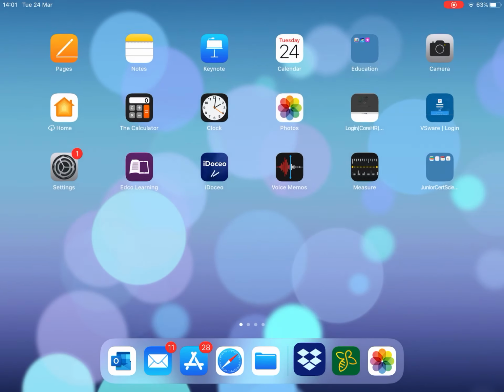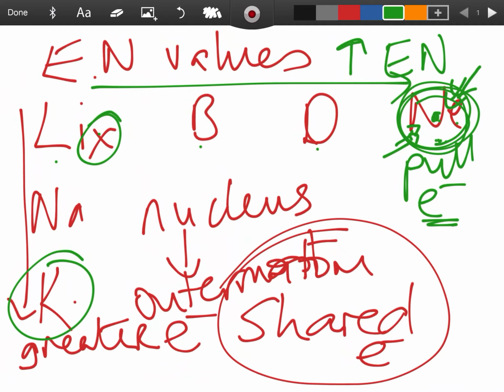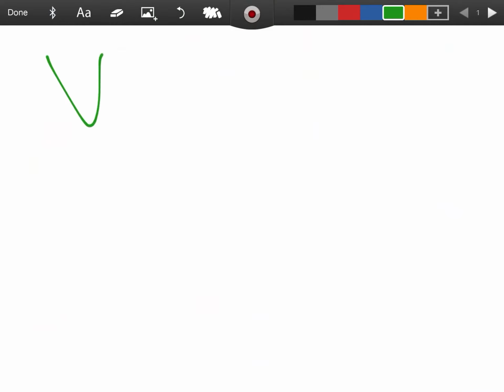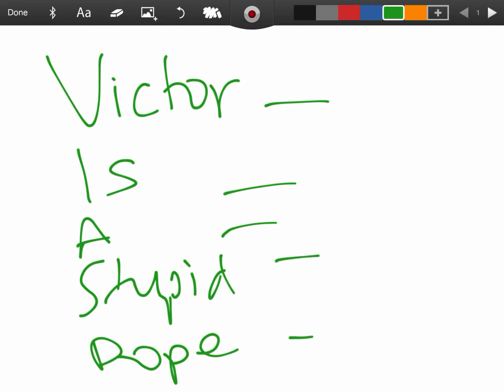Okay? Now, just finally, I just want to run through on the show me board there. We use Victor is a stupid dope. Now, how is Victor is a stupid dope going to help you? It'll help you with the 5 stages or processes that occur in a mass spec.